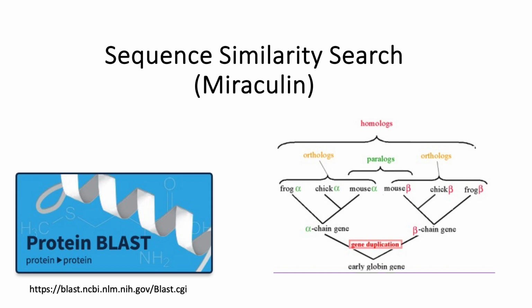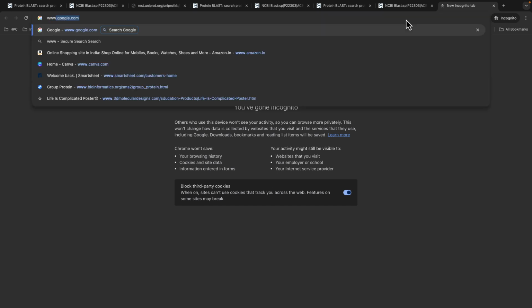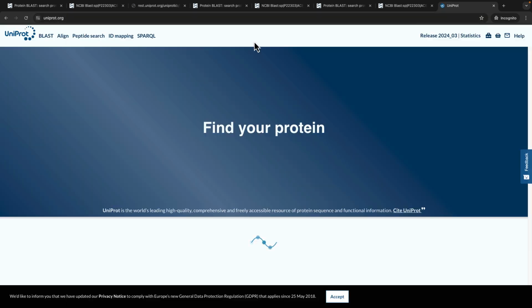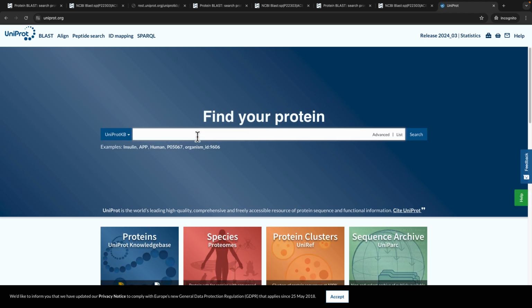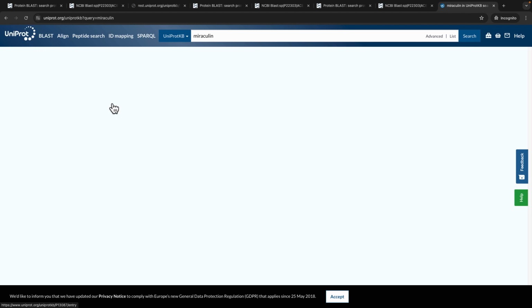So go to the UniProt website. I hope you remember the web address of UniProt, www.uniprot.org. Just type the protein name, which is Miraculin. So we'll click this P13087, which is Miraculin.